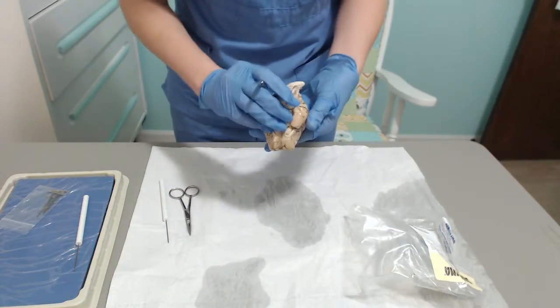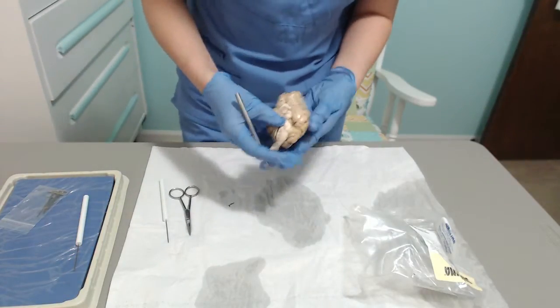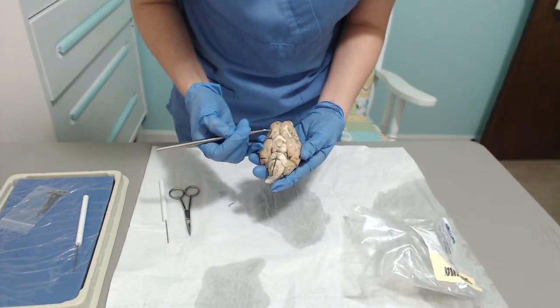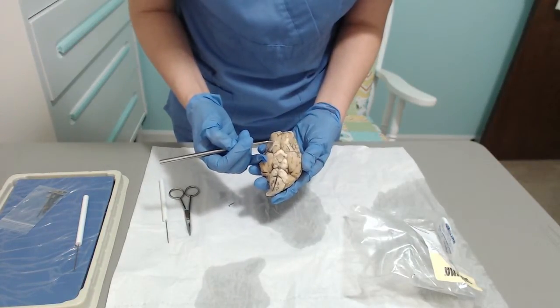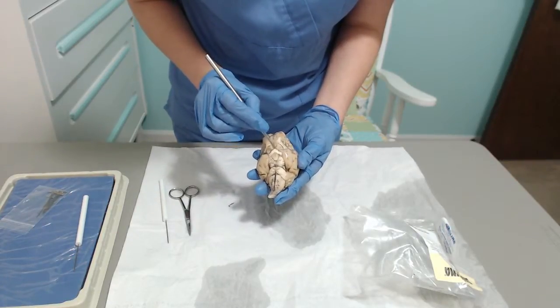Okay, so we're going to go underneath. When you look at this side, the first thing we're going to look at is the optic nerve, and they would have come out right here.